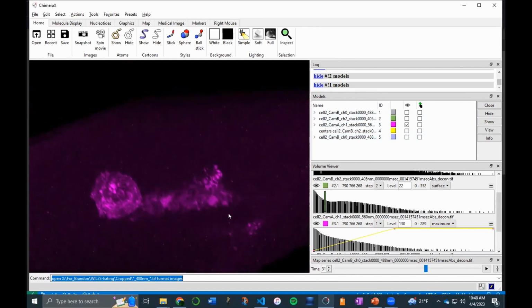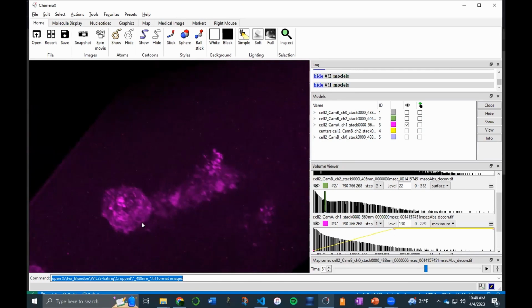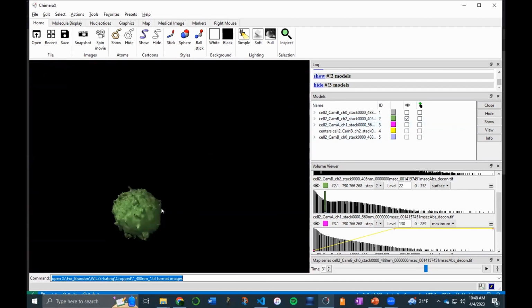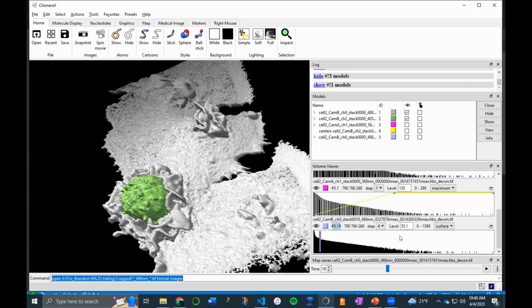So this is this volumetric projection that we can see our antibody surfaces here. We can mix and match that with different isosurfaces and have multiple isosurfaces at the same time. And again, being able to play these through, and now I'm on the wrong one.